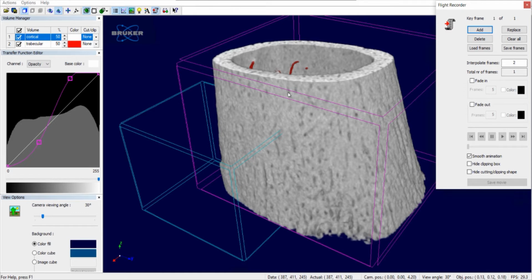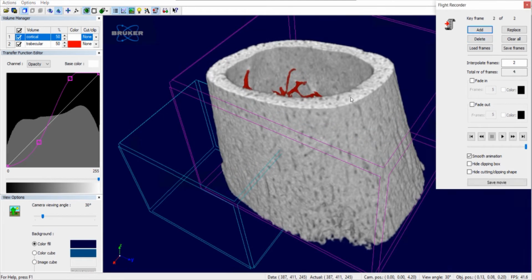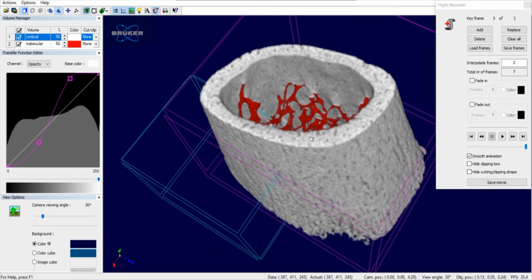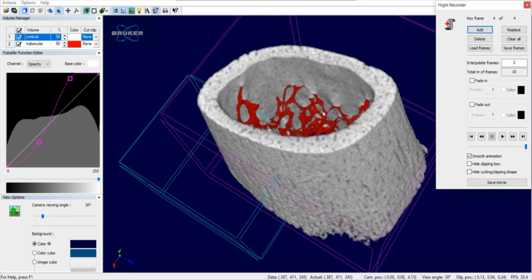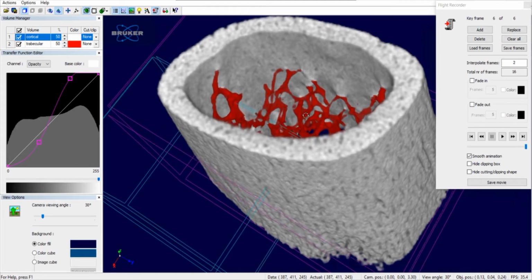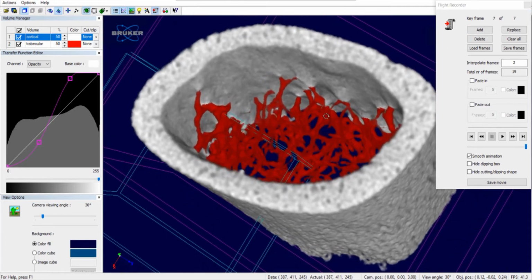your object now. And from this point, I can do any movement, any cropping, any change, and add another frame. For example, I would just rotate a little bit like this and add another frame. I will keep on, oops, not the left button, it happens, I'm used to another software. Keep rotating, try to be very smooth, not to make very long movement. And now I'm going to zoom in 1, 2 times and a little bit more. And I will, in the next frame, I will rotate a little bit and zoom at the same time. You will see the result. Keep on doing this.